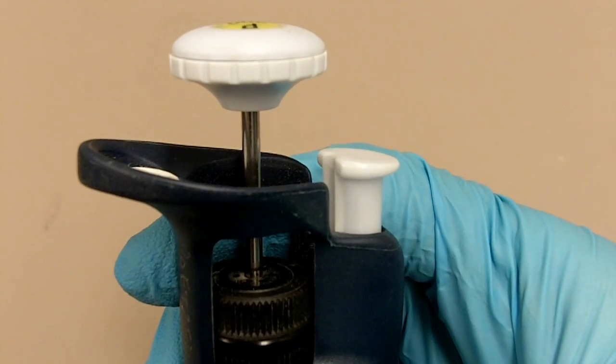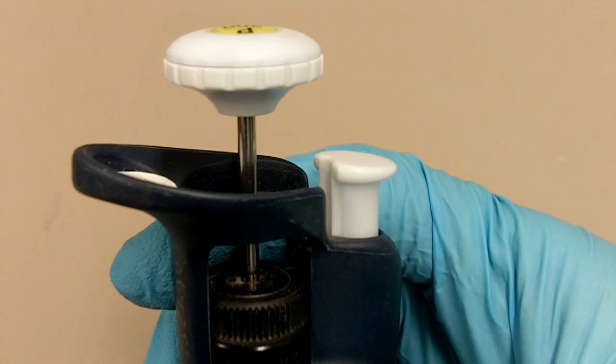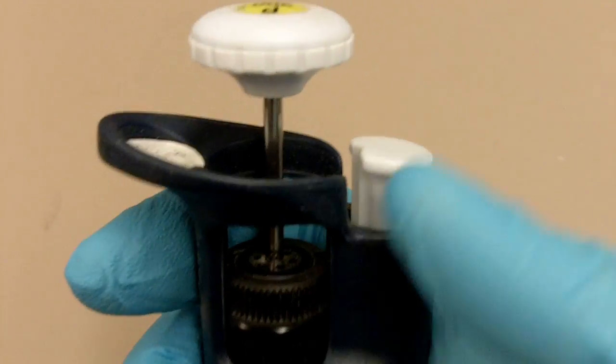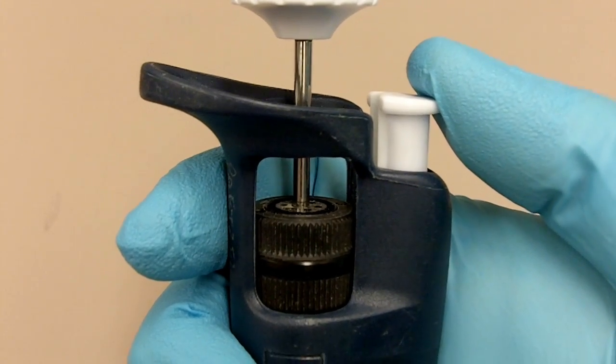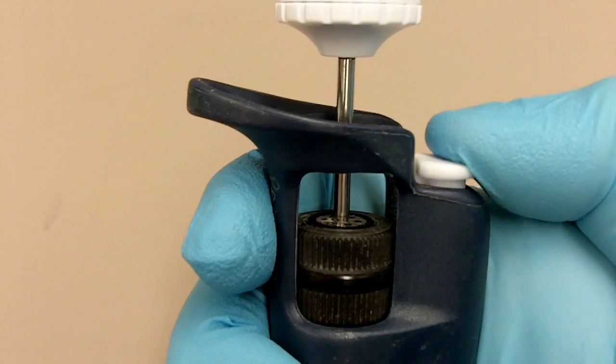So right now I'm going to show you how to eject the tip and how the ejector works. So here, this is the tip ejector button. When you want to eject the tip, all you have to do is press it down like that.